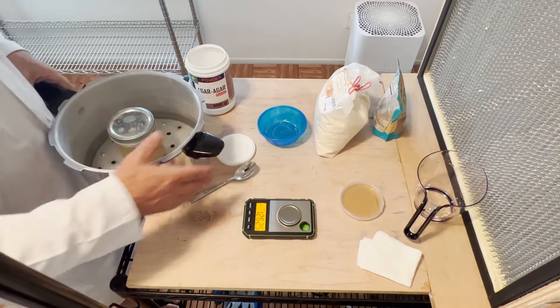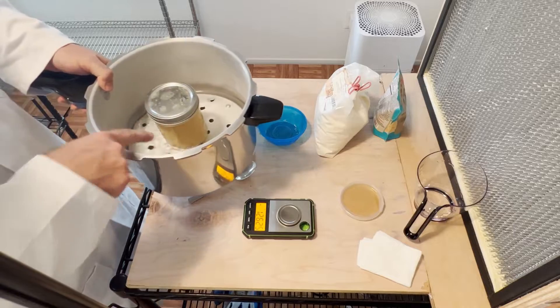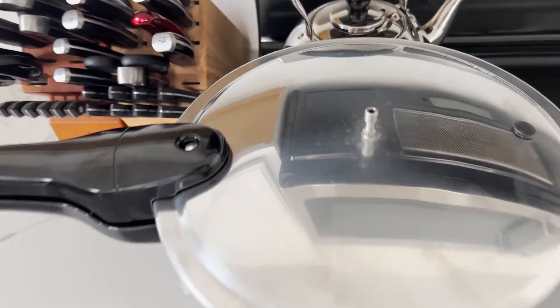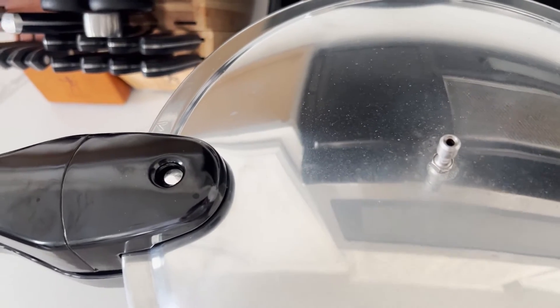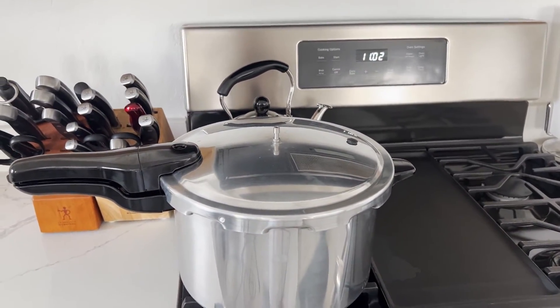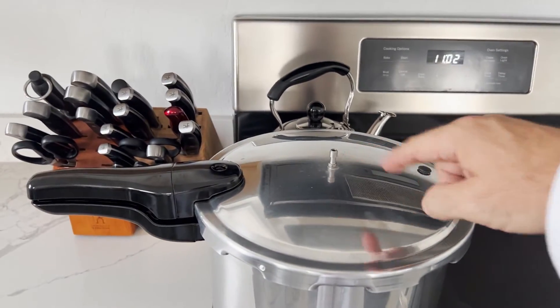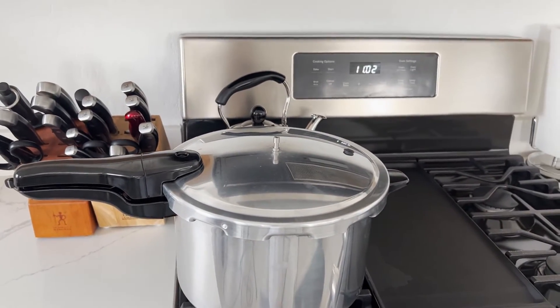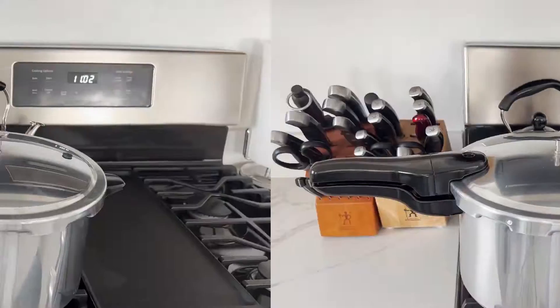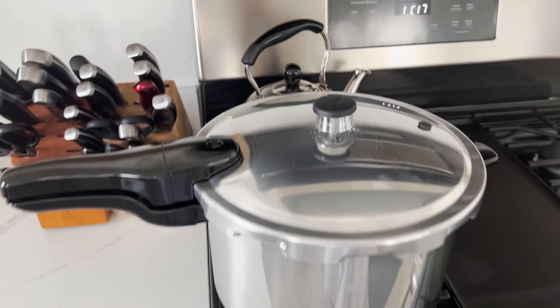Put the jar in the pressure cooker with enough water to fill about halfway up. The pressure cooker just came up to pressure — the little valve just popped open. It's 11:02, so we're going to give it 15 minutes to steam off before we put our rocker on top. We'll come back at 11:17 and then put the rocker on.